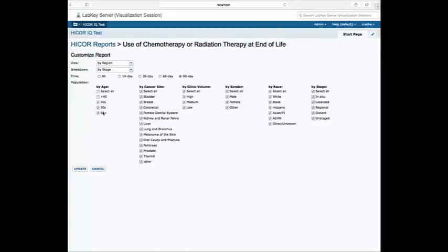So each of these checkbox columns in this case are the dimensions of data that are filterable. There's an XML definition applied to the data summary table itself that defines which columns are dimensions and which are plottable measures, and the ones marked as dimensions show up here in checkboxes that you can add or remove different categories.